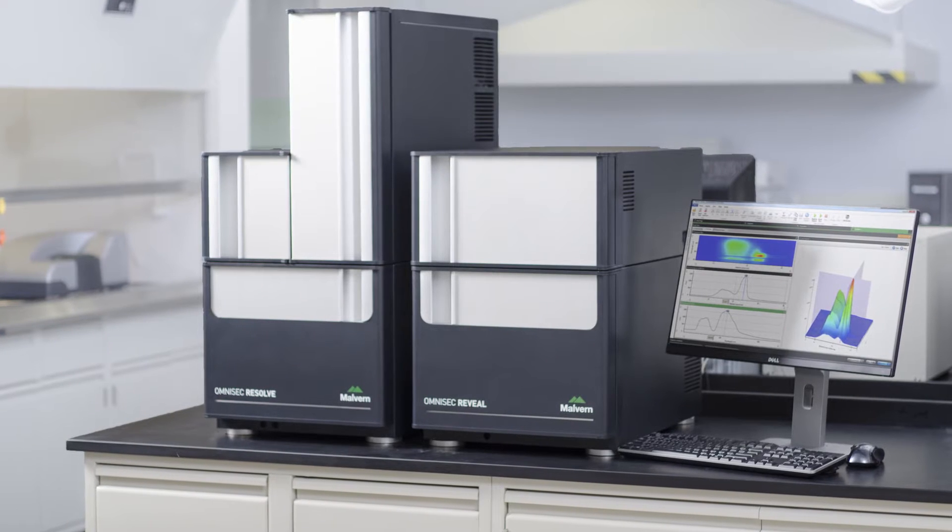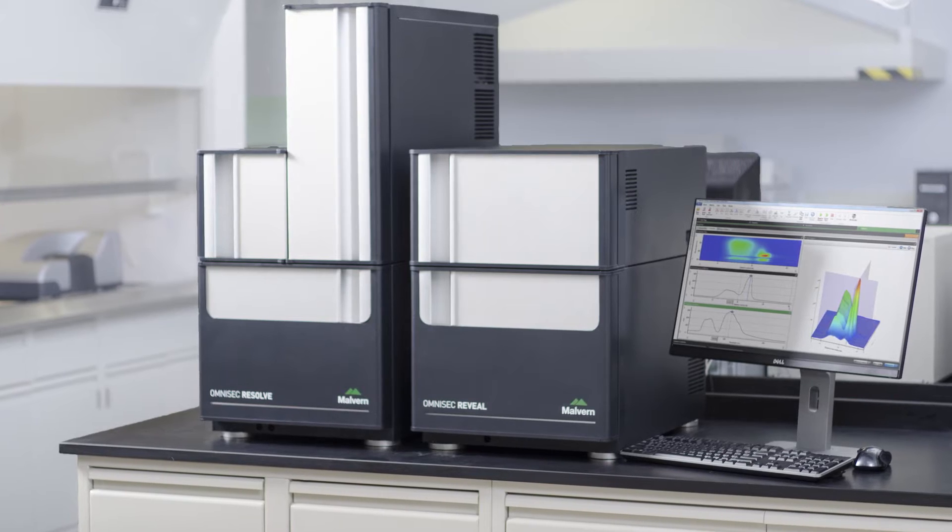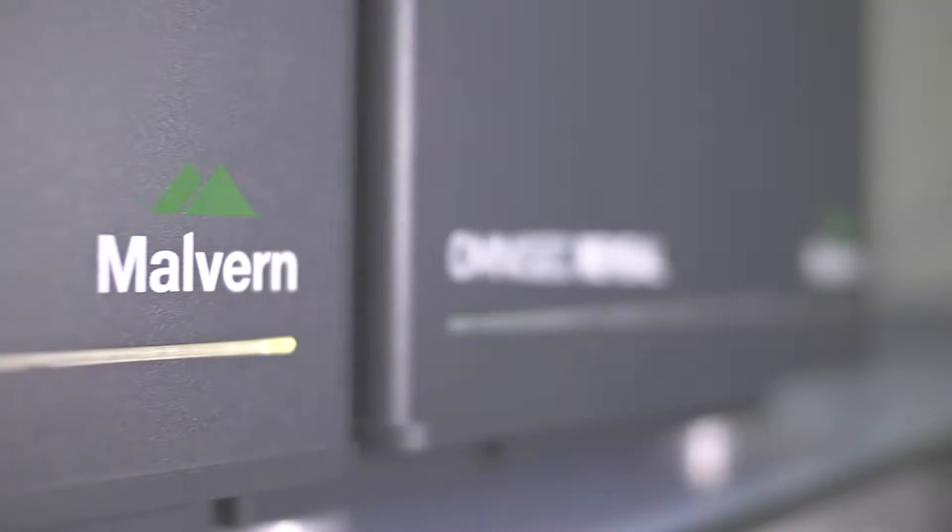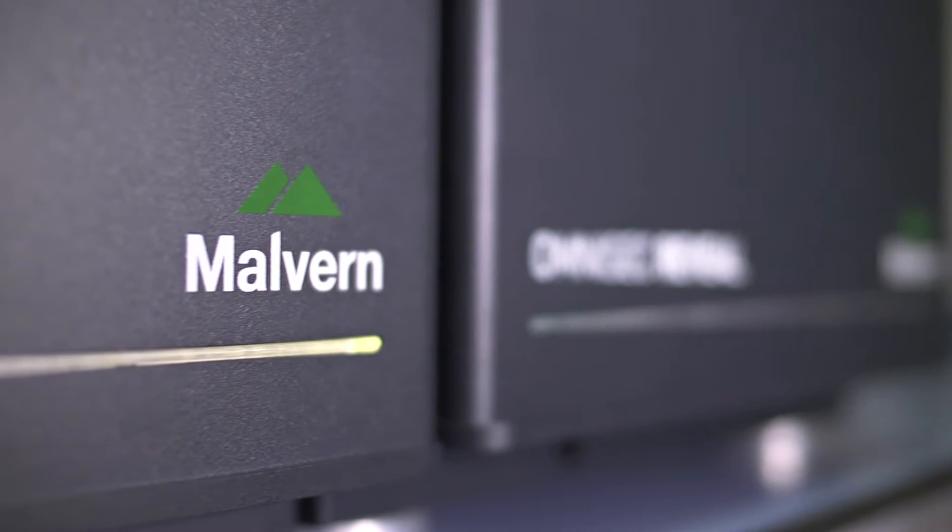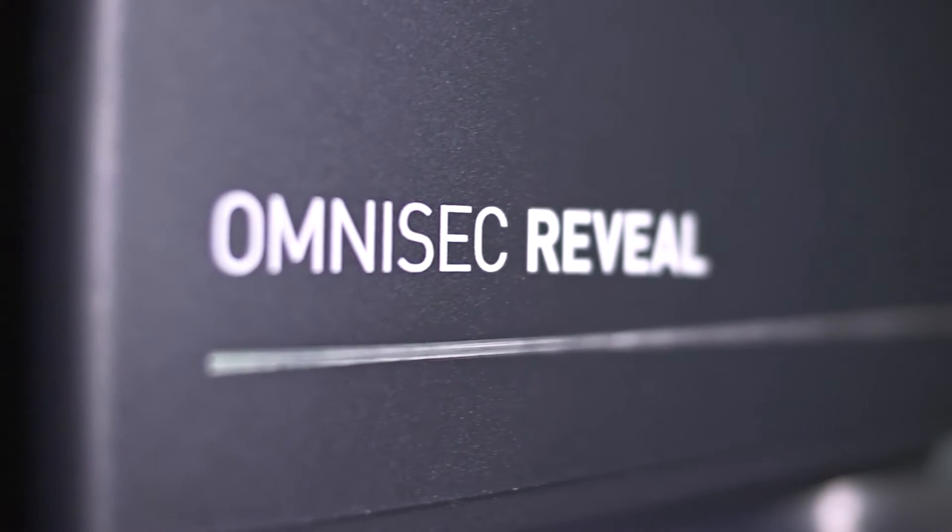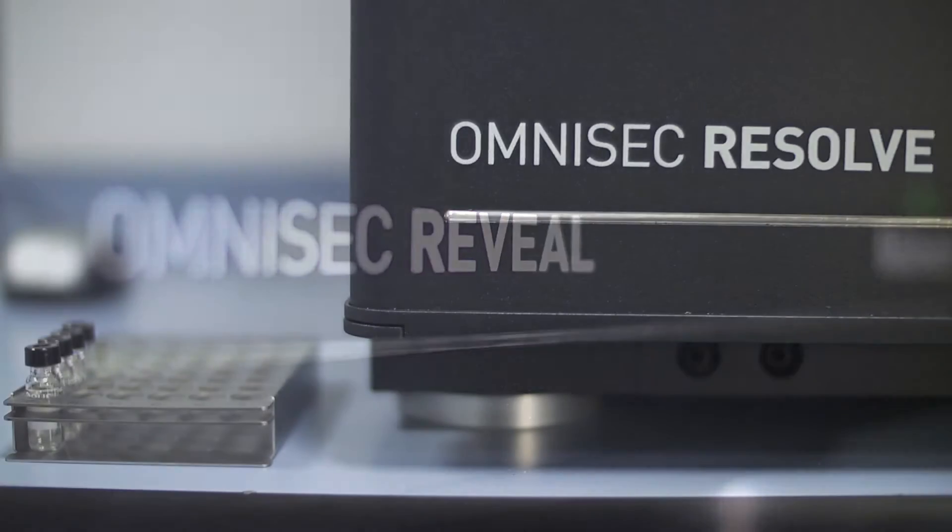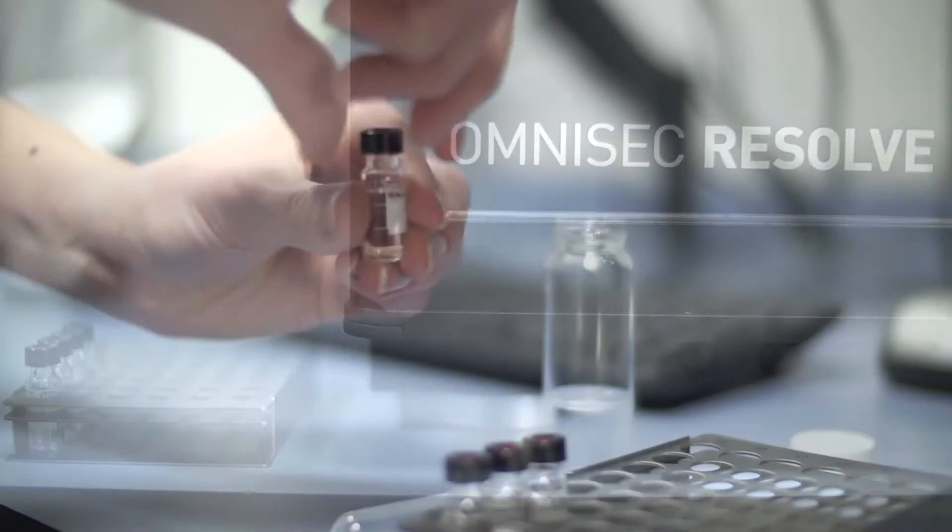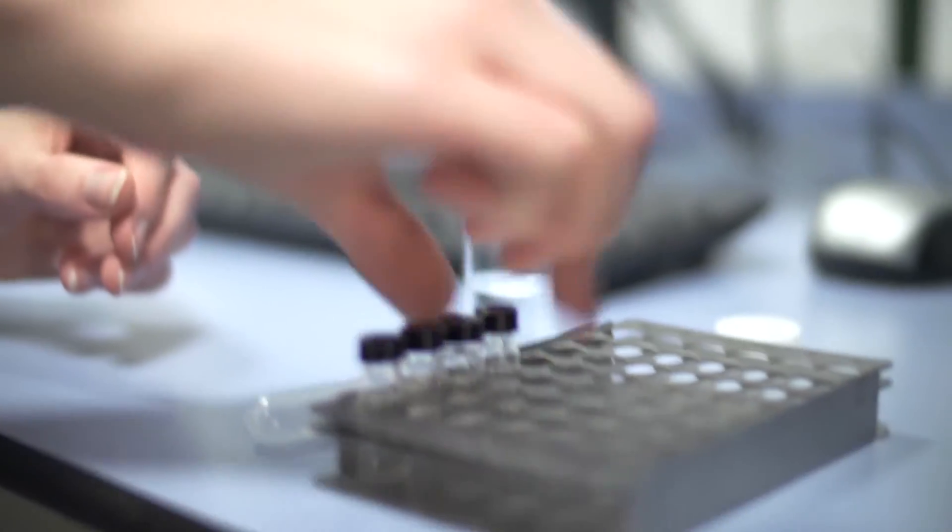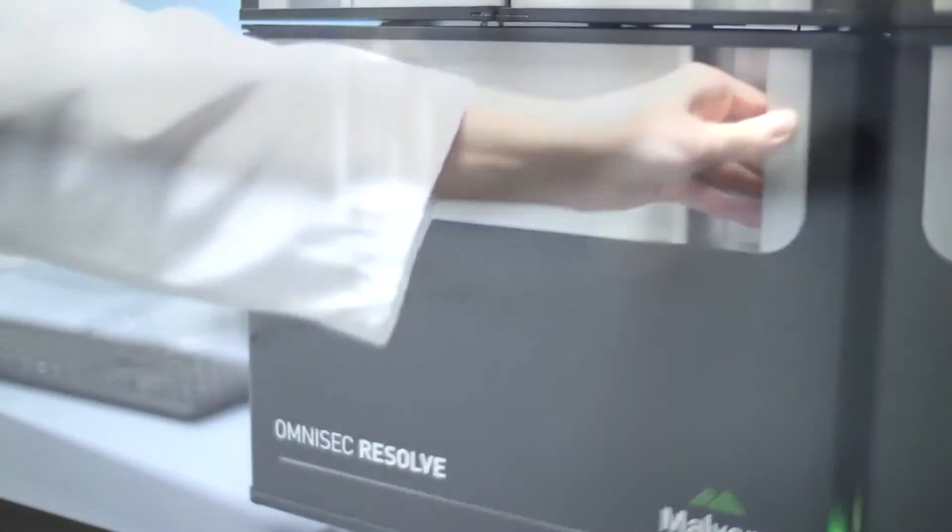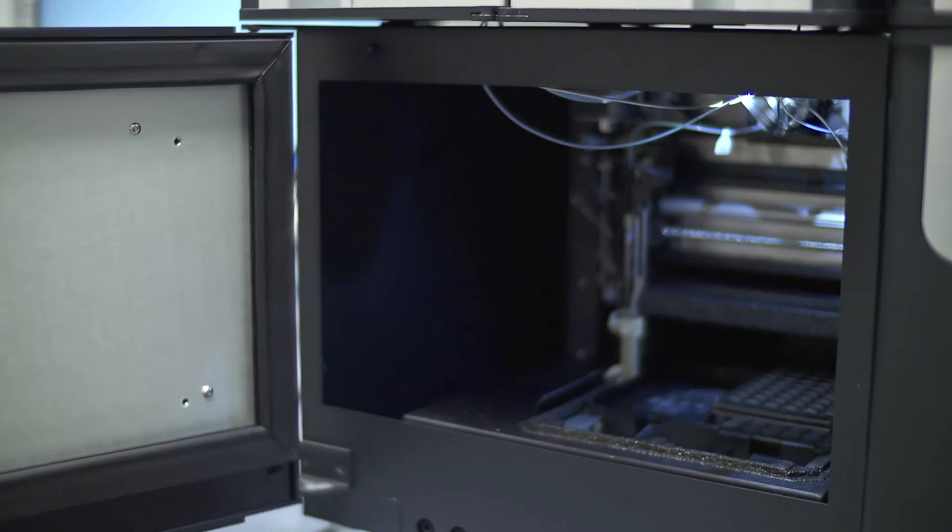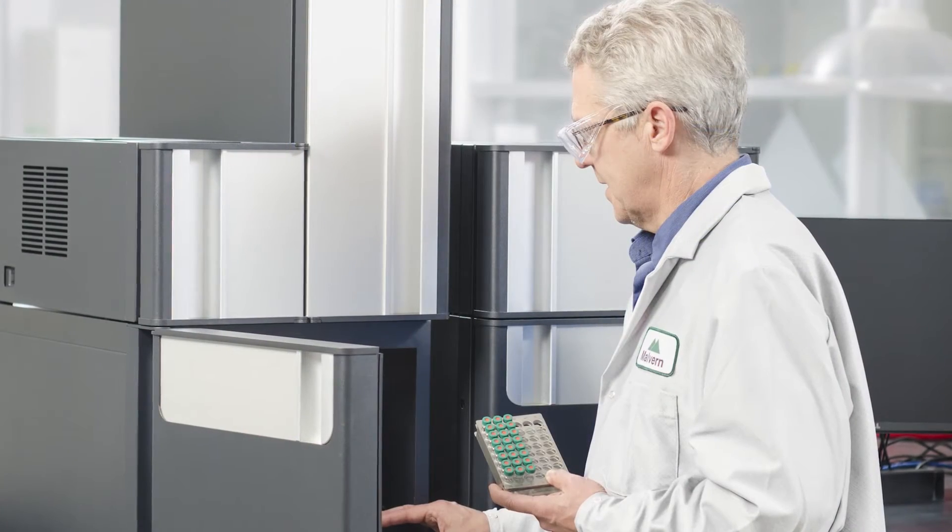Omnisec is the latest size exclusion chromatography or gel permeation chromatography system from Malvern Instruments. Using our 30 years of SEC and advanced detection experience, we have developed the most sensitive and accurate multi-detector chromatography system for the characterization of synthetic and natural polymers and proteins.